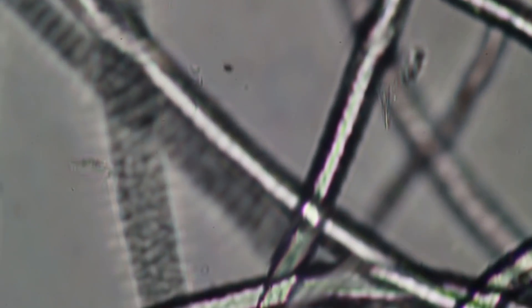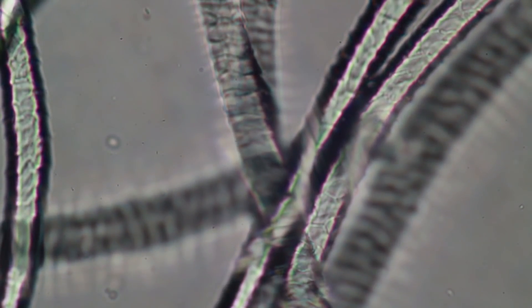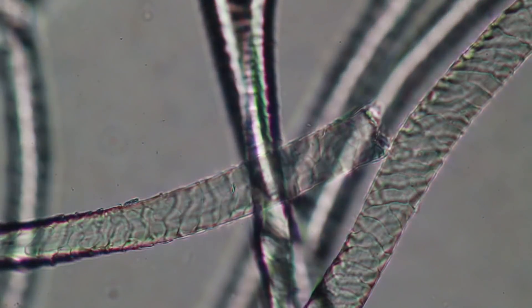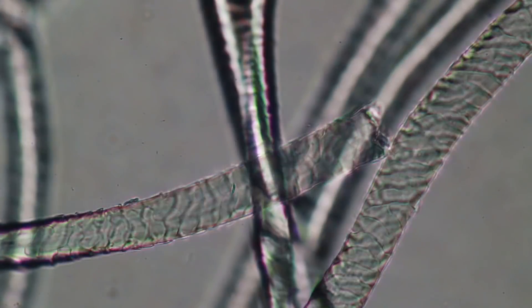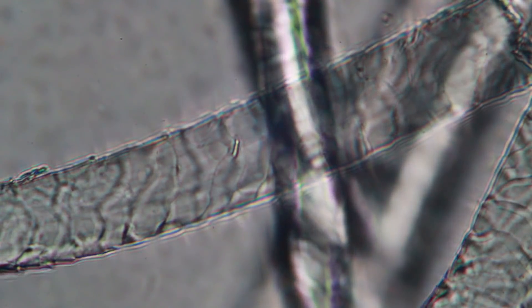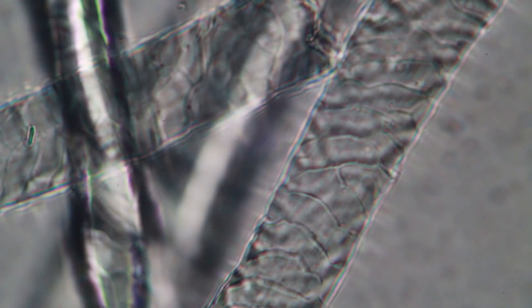Focusing was a little bit difficult because there were so many layers on top of each other, and the specimen was a little bit thicker than I anticipated. Here we can see a nice cut — this is the place where I cut one of the fibers. At yet higher magnification, the individual fibers are actually pretty transparent. How do you call individual fur pieces? You call them fibers, maybe. In any case, I thought this was quite nice and quite interesting.